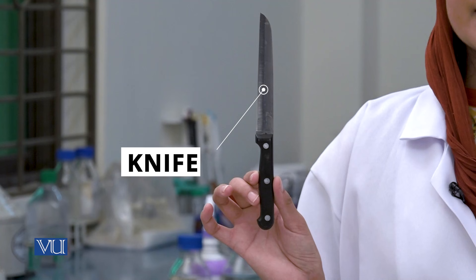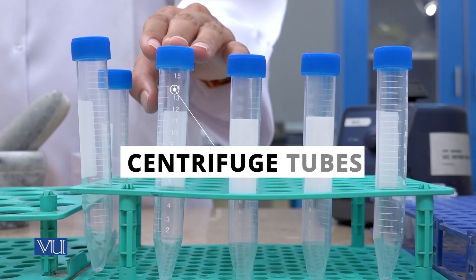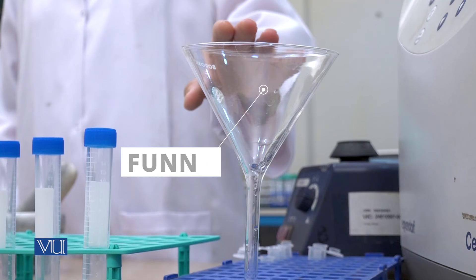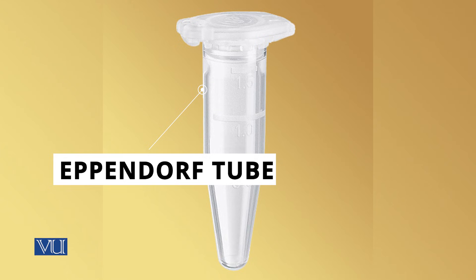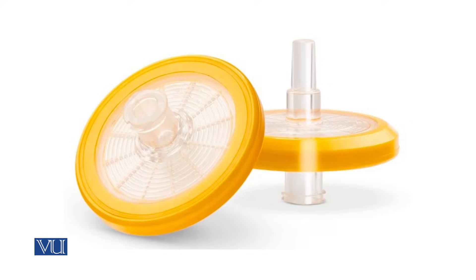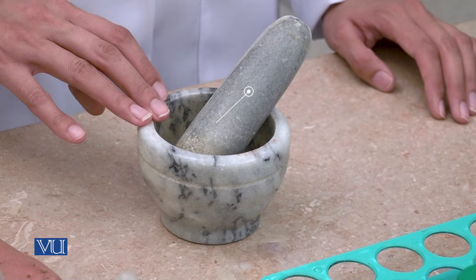First, we will look at the materials we need for this experiment. We will need a potato from which we will extract starch, a knife to peel and cut it into small pieces, a mortar and pestle, blue-capped centrifuge tubes, iodine solution, 20 millimolar sodium phosphate buffer, a funnel to transfer material into the tubes, eppendorfs with a capacity of 1.5 ml, a vortex mixer, centrifuge machine, syringe filters, and a syringe.